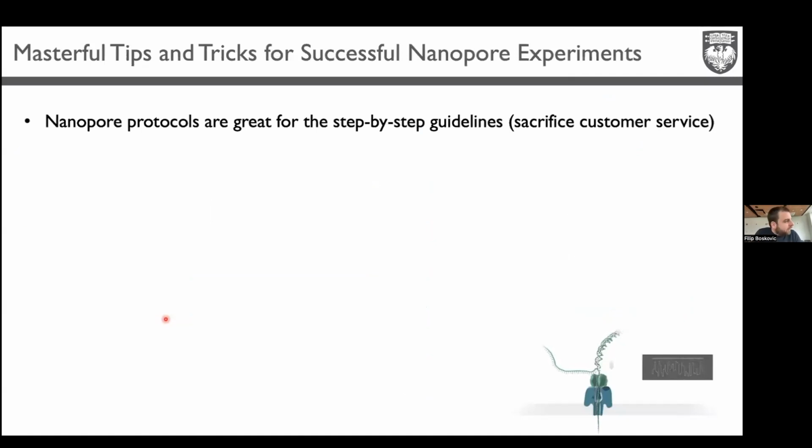Fatih put in the announcement masterful tips and tricks for a successful nanopore experiment. I think that depends more, of course, on the quality of your sample. So you want your RNA or DNA to be in good quality, not degraded. That RNA has a 5' phosphate, so you can do ligation and so on. So it's the same as for Illumina. And nanopore protocols are great.